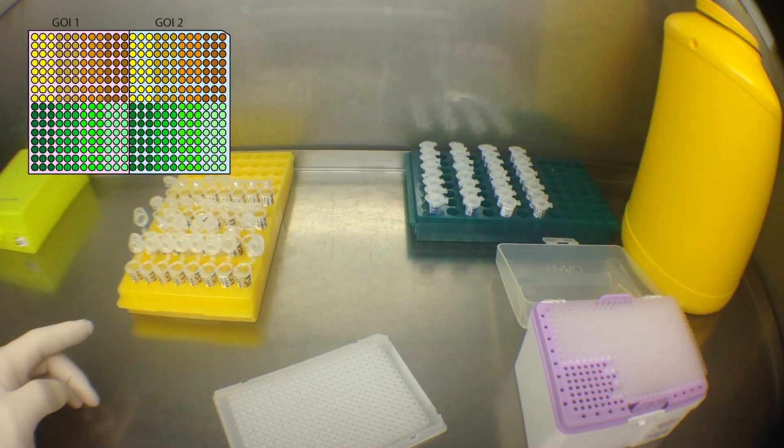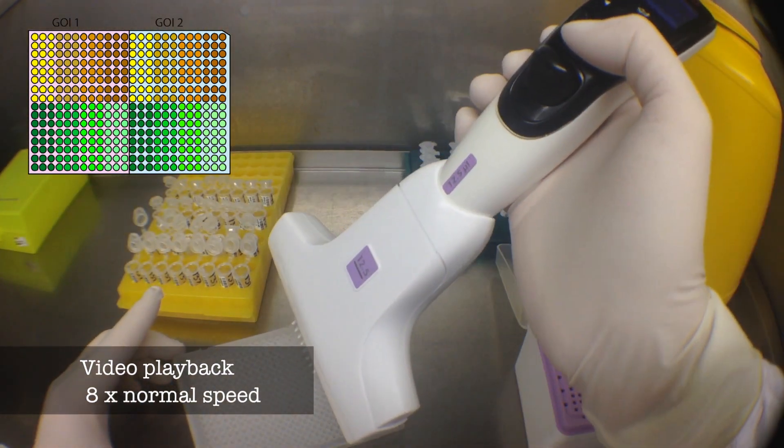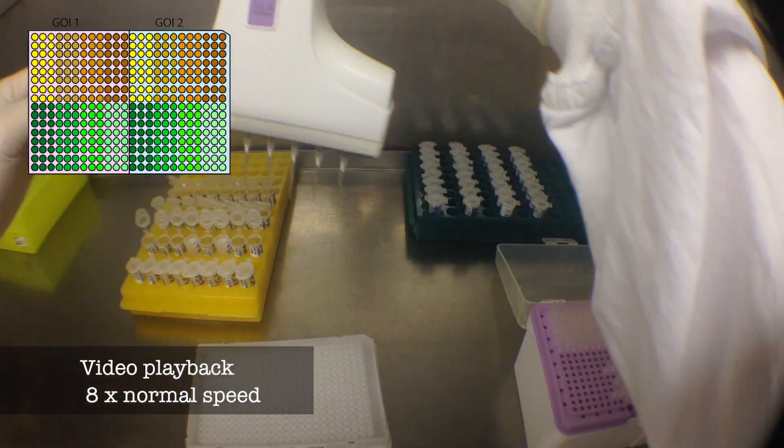Here I'm loading my first set of 8 samples in triplicate for Gene of Interest 1 and then also Gene of Interest 2. Now I'll move on to the next set of 8.